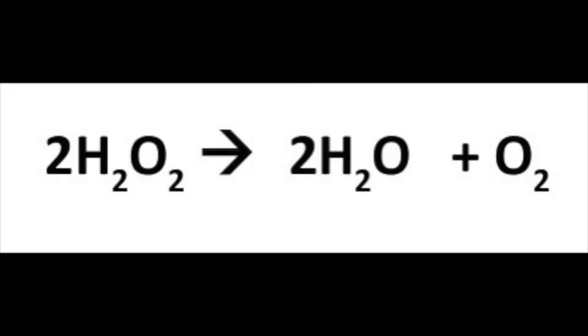So what happened to cause this? The hydrogen peroxide is undergoing a decomposition reaction, meaning that it's breaking down into the 2 substances that make it up. The yeast itself is not involved in the reaction.